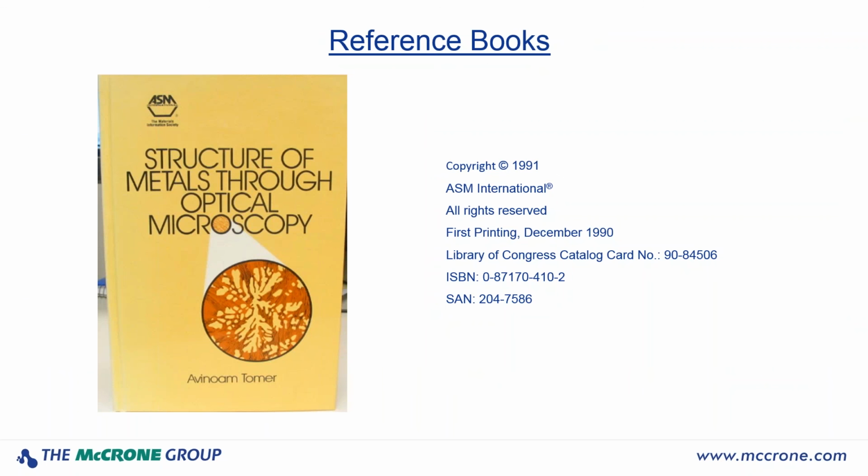So I'm going to close here a little bit with giving you some references that you can look for. If you're still interested in optical microscopy of metals, this is a great reference book, Structure of Metals Through Optical Microscopy by Tomer. It's copyrighted 1991 by ASM International. It's probably not available now.